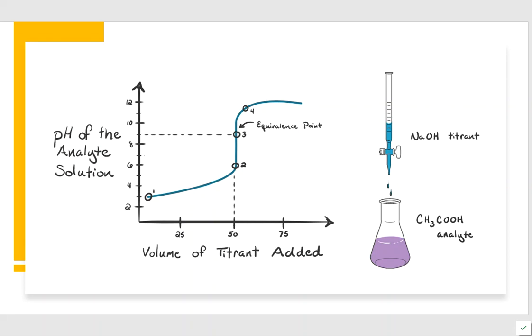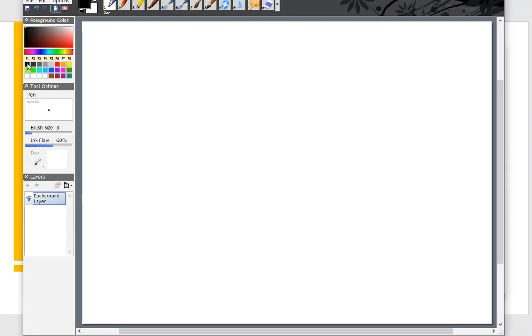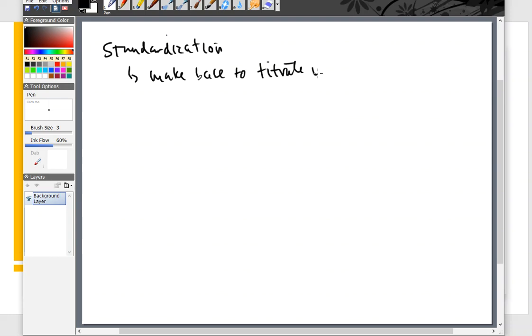Now, with this very first titration, we are going to go through a process called standardization. Standardization is a very important process whenever I make a base to titrate with. You know, we do not like to order things, folks. We pay for water to be shipped when we do that, and we hate that. So in a laboratory, we like to make our solutions from scratch, and we can do that without a problem. The problem here, though, is that we do not get exact amounts that I should be weighing out.